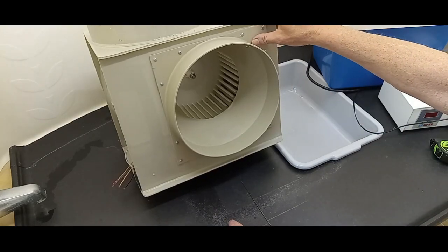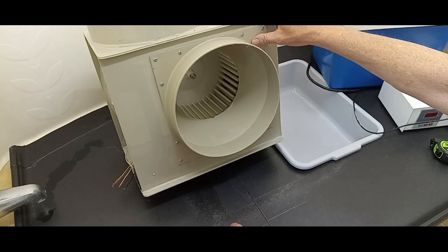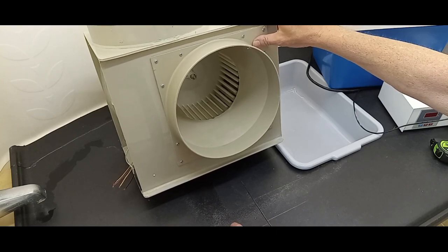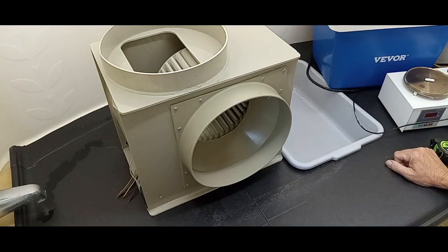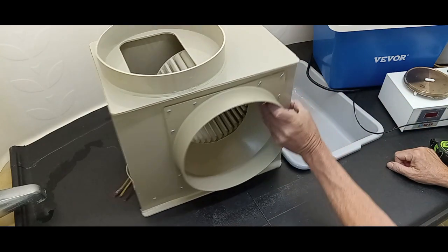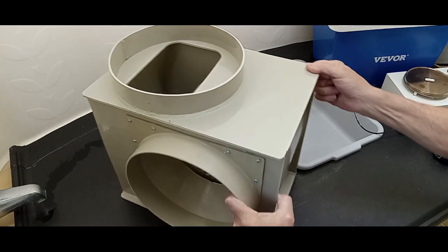According to the rating on it, it's 2,300 cubic meters per hour, so 1,353 CFM, which is a pretty significant amount of air movement.